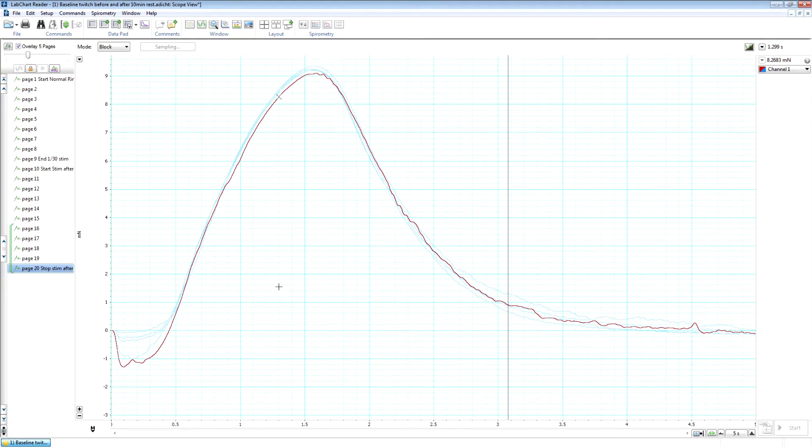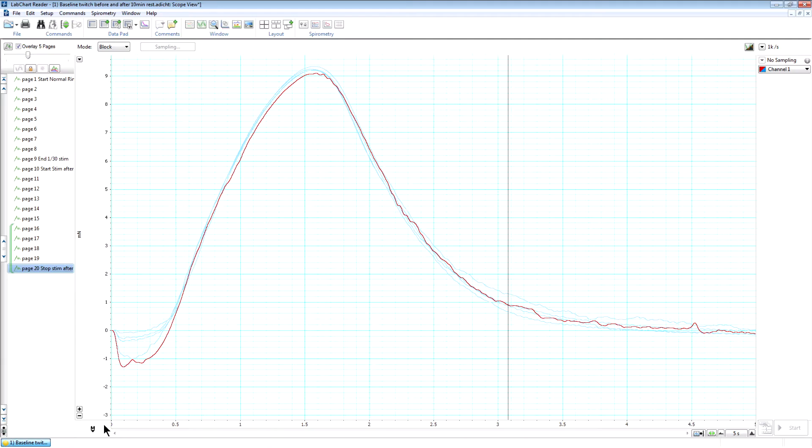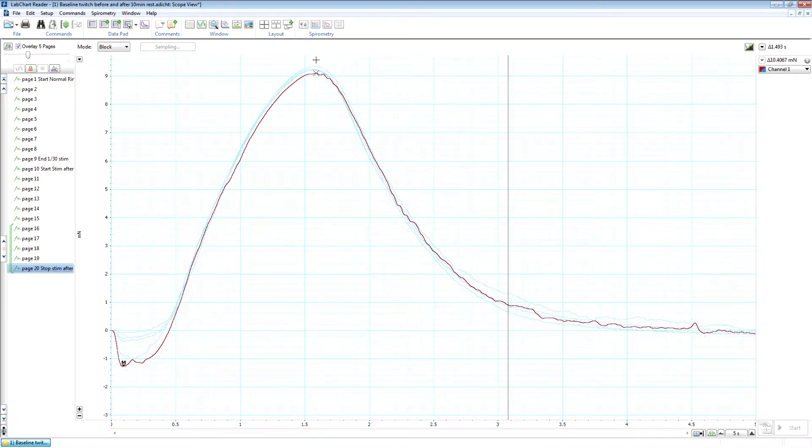Now just as a reminder for those of you who haven't used LabChart before, when you want to measure something, you'll need to use the marker. To do that, you'll grab the marker from the lower left corner of the screen and then drag it to the trace. And you then use the mouse over the part of the trace that you want to measure, and then your reading will be in the top right hand corner.